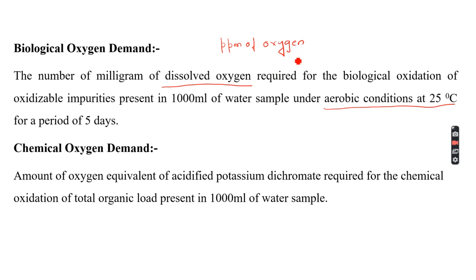This is empirical. The main thing is it is empirical and semi-quantitative. It is not accurate. It is a semi-quantitative method. It represents only biodegradable impurities under aerobic condition. Determination is slow and time consuming.